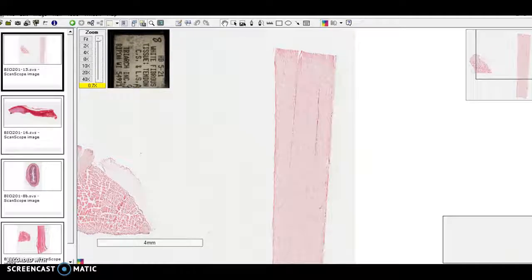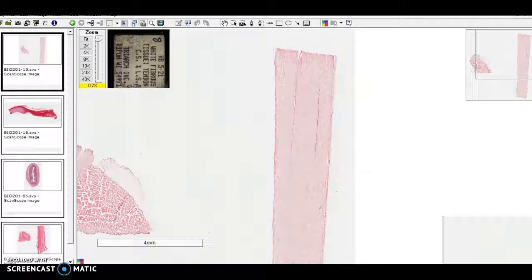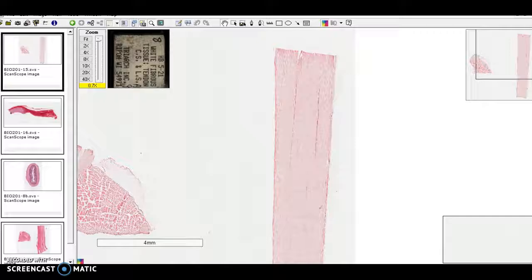Dense regular connective tissue is one of the dense fibrous connective tissues. I think this is one of the most challenging ones to recognize, and that's mostly because it has so few features.